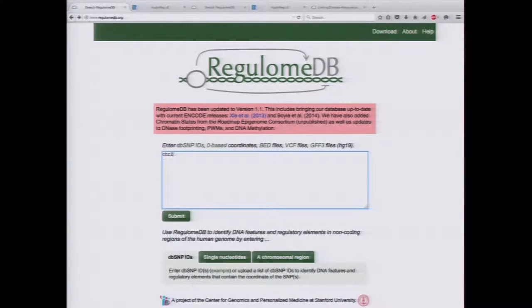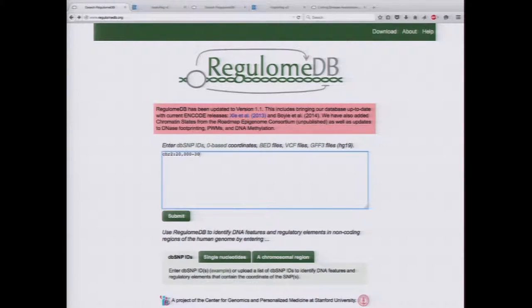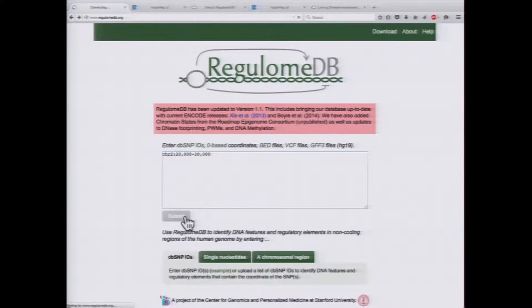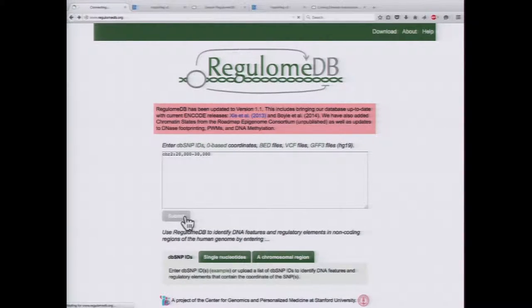For example, if you want to look at a region on chromosome 2 — a 10KB region between 20,000 and 30,000 — you can just submit that to RegulumDB and it's going to search through to find all the variants in the region.